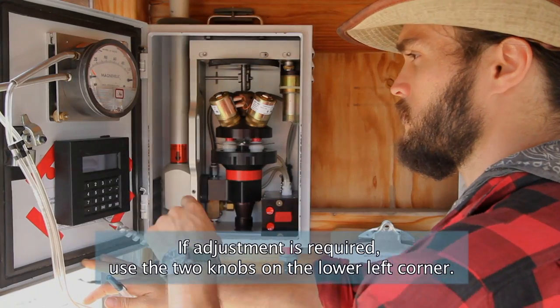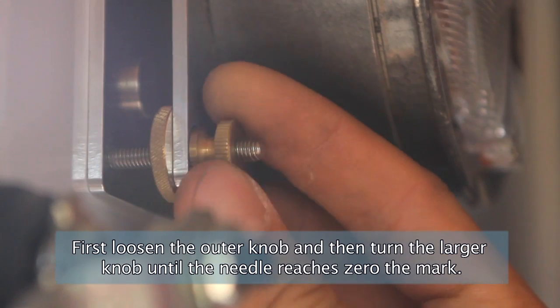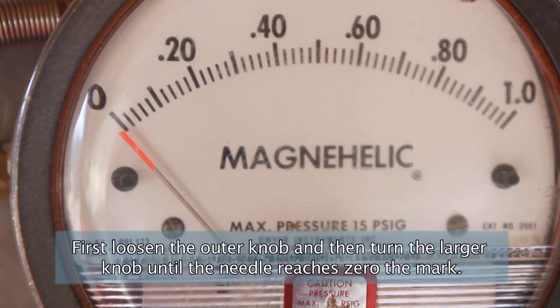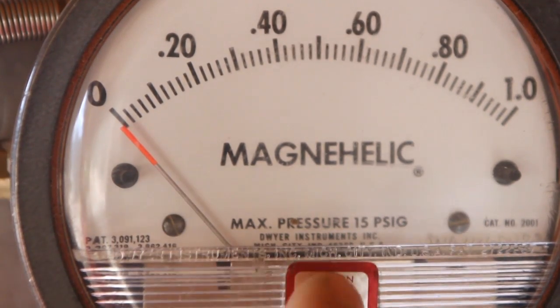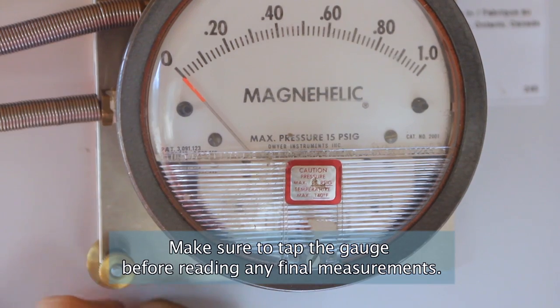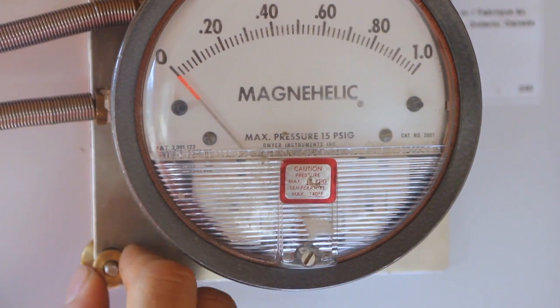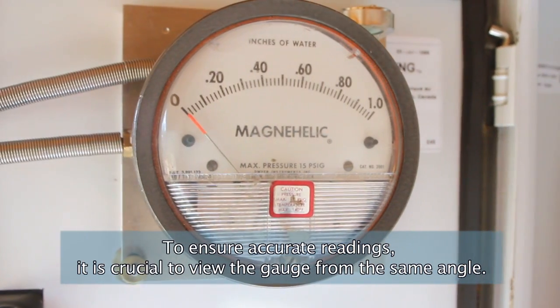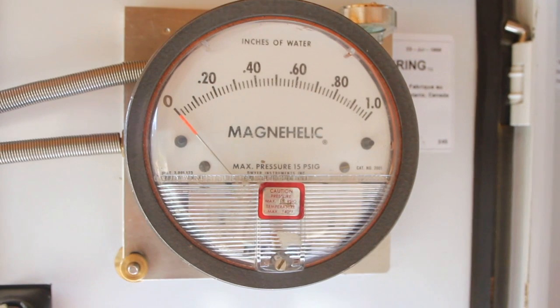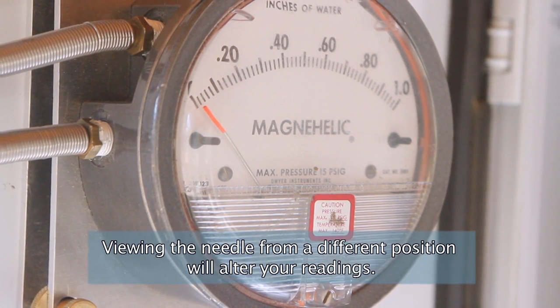If adjustment is required, use the two knobs on the lower left corner. First loosen the outer knob, and then turn the larger knob until the needle reaches the 0 mark. Make sure to tap the gauge before reading any final measurements. To ensure accurate readings, it is crucial to view the gauge from the same angle. Viewing the needle from a different position will alter your readings.